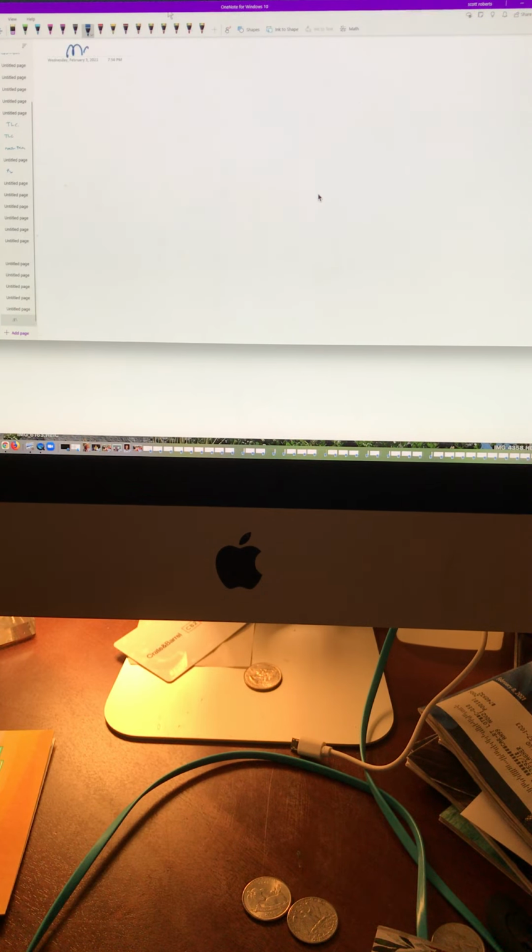Okay, mass spec. Very quickly. So mass spec, long story short, you get molecular weight. And this is awesome for getting molecular weight. Like really awesome for molecular weight.